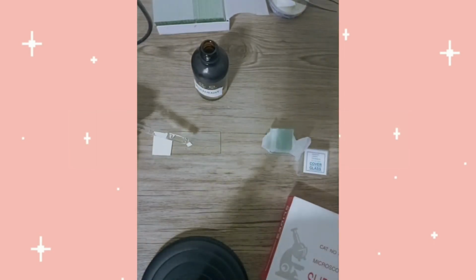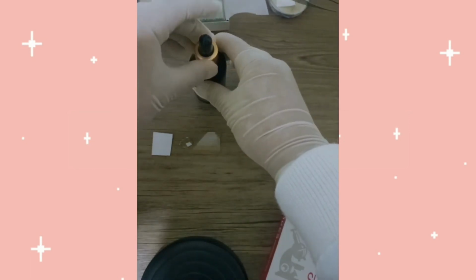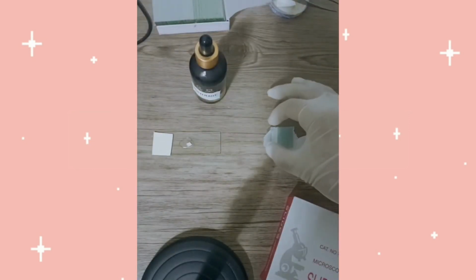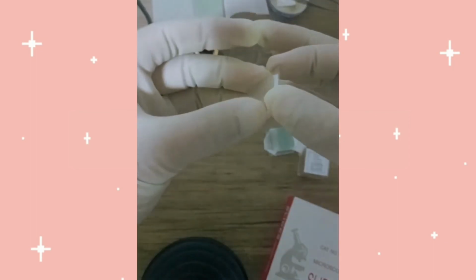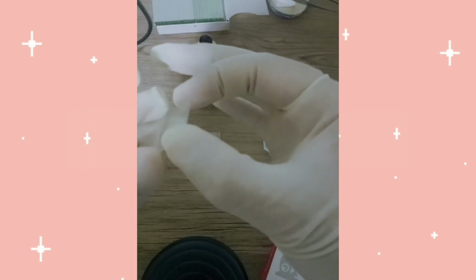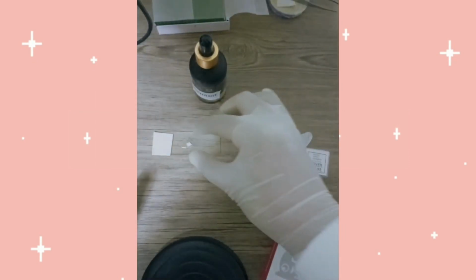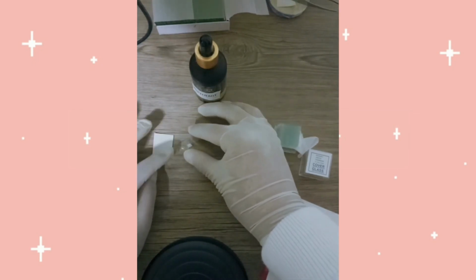Make sure it is enough for you to have your mountant because it will leave some air bubbles later when we try to put some cover glass slides. Now next one we have here is to put our cover slip. When you put your cover slips, make sure it fills up the whole specimen and just leave it below.